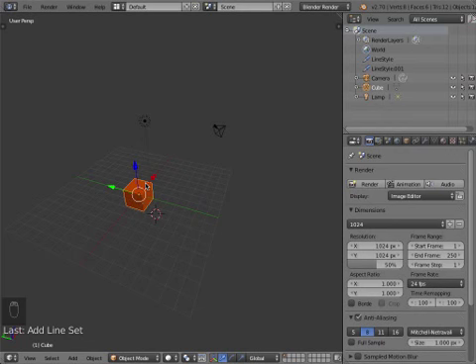And there's the very first thing that's actually different between what's in here and what we are going to be working with, because Blender or most CG software can work with triangles, quadrilaterals, and polygons. Everything we do is just going to be triangles. So always make sure that your surface is fully triangulated when you're going to be using it for analysis. The reason is that only a fully triangulated surface is an unambiguous surface.